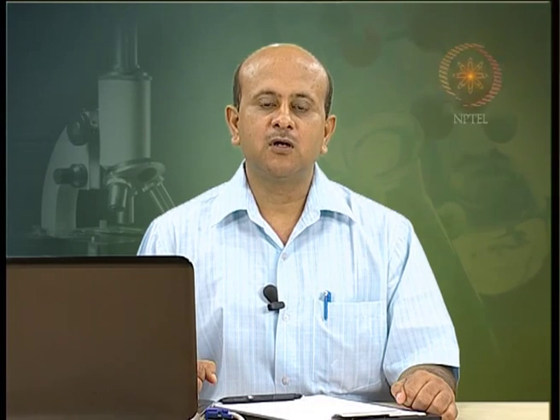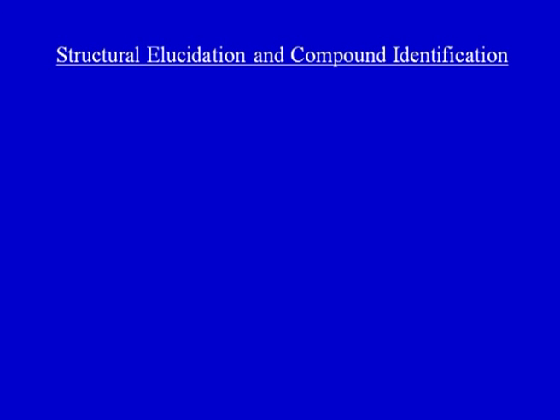So, these characteristic spectra are obtained, and they could be utilized for structural elucidation and compound identification.